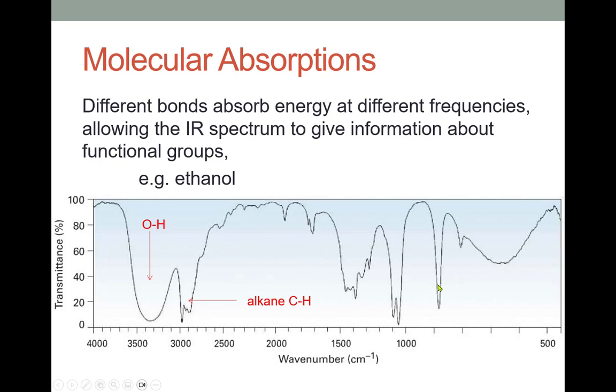Just like in the case of mass spec that we talked about previously, you don't want to spend your time sort of trying to figure out which absorptions come from which particular interactions. It's not as useful an exercise as you might think. What we're looking for are patterns, and particularly these very indicative patterns like the OH, this broad stretch that happens in the mid-3000s.